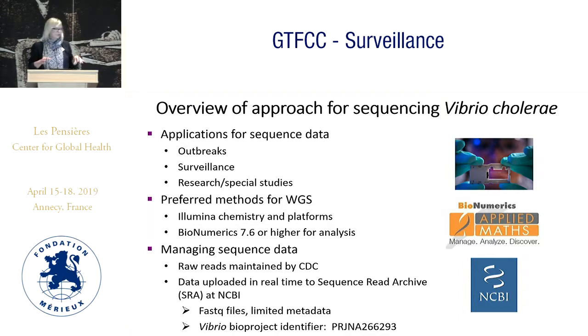And we manage our sequence data. The raw reads are maintained by the CDC. And the sequence data is uploaded in real time to SRA, the Sequence Read Archive at NCBI. Those are the FASTQ files. It goes along with limited metadata. And you can trace all of the Vibrio genomes that we have uploaded into NCBI using the BioProject identifier.